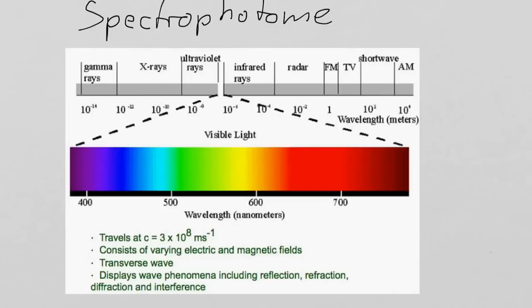And these electromagnetic waves are usually expressed in a certain wavelength. Let's not worry too much exactly how this wavelength is measured, but it suffices to say that blue light is in the range of 400 nanometers, whereas red light, what we see as red light, is in the range of 700 to 800 nanometers.